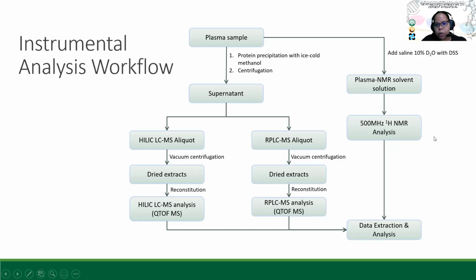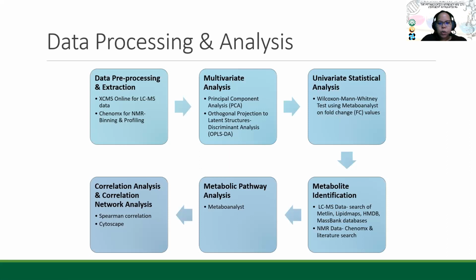So this is high resolution proton NMR analysis as well. And subsequently, the data was extracted and analyzed using chemometrics. So again, we will cover more aspects of this instrumental workflow, or the experimental workflow for metabolomics, in the subsequent session. So this is just to show you an overview of the data processing that has been done.